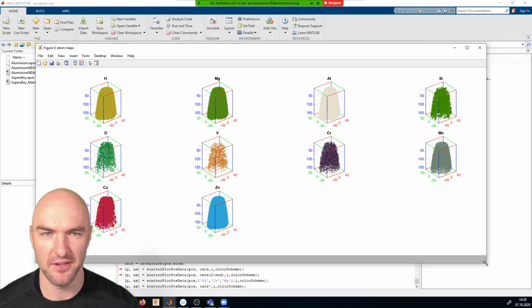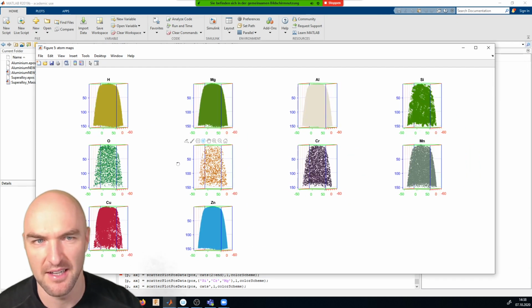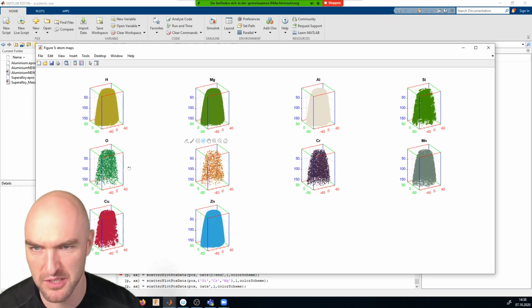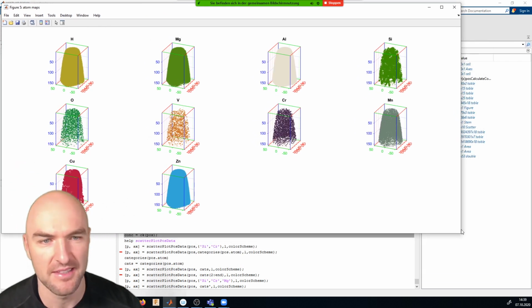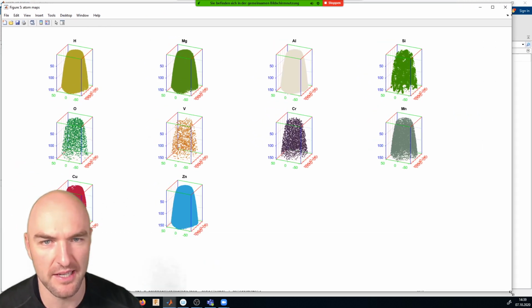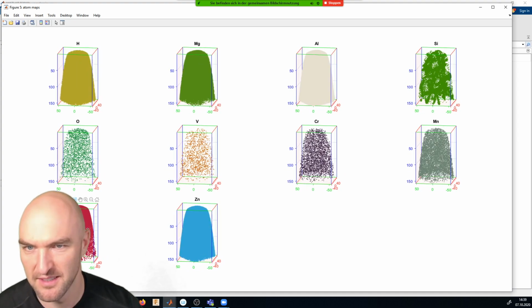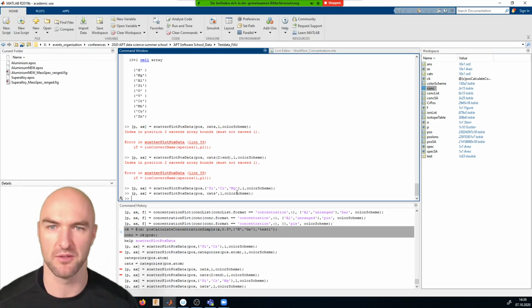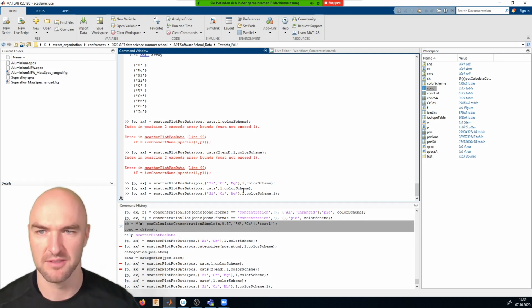So if you do that, you get a display of all of the different elements we have in there. And you can rotate all of them and have a look which ones show structures, which ones don't show structures. Obviously, this depends on the amount of screen real estate that you have. Whether that makes sense or not, I might just replot it with smaller dots.